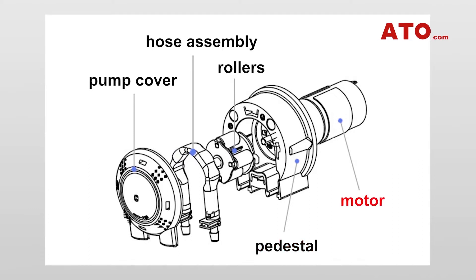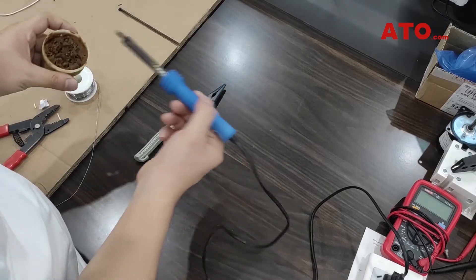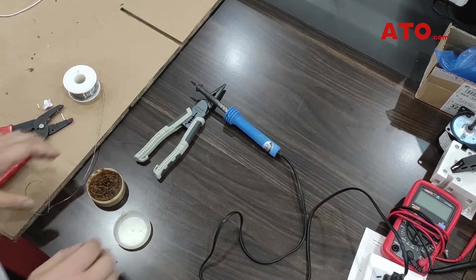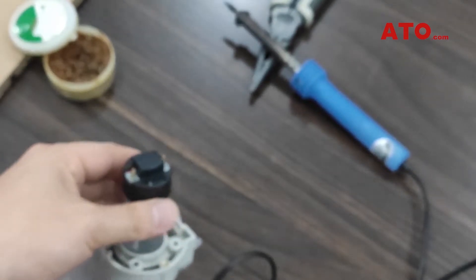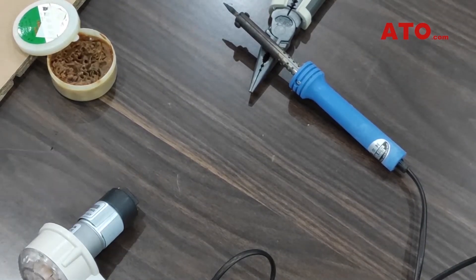There are peristaltic pumps that are suitable for DC gear motors, DC planetary gear motors and stepper motors. These motors can also be found at ATO online shop. In this video, we are going to use a DC gear motor driven pump to show you how it works. The peristaltic pump shown in this video is model ATO-104KA-ZL, rated at 24V DC with a pumping volume of 220 ml per minute.